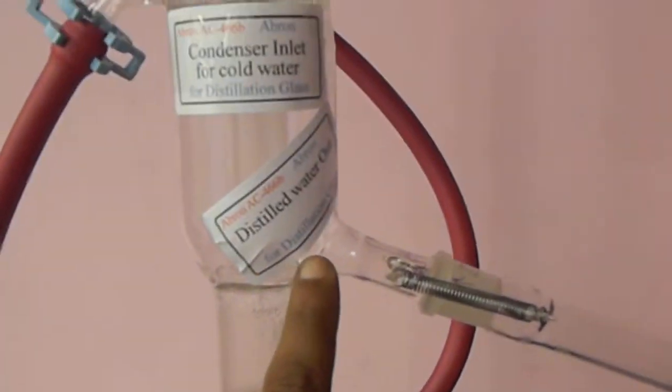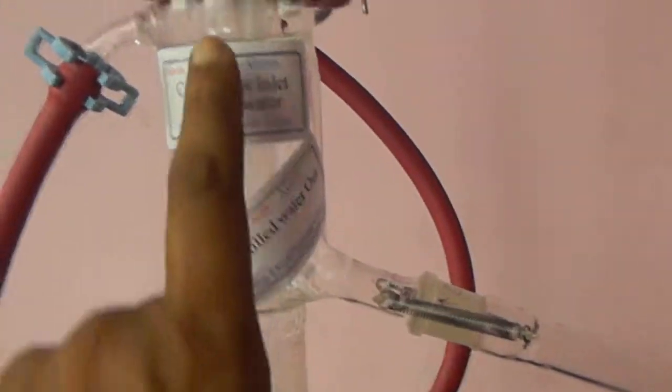First, this is a double distillation. This water is distilled inside. And then distilled water comes from this section to the second unit.